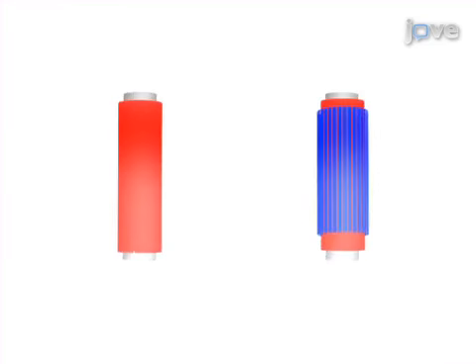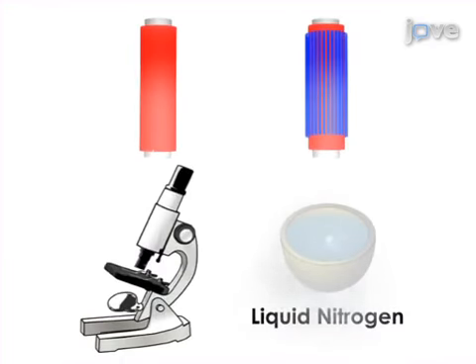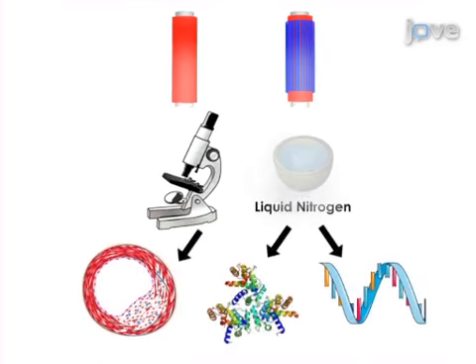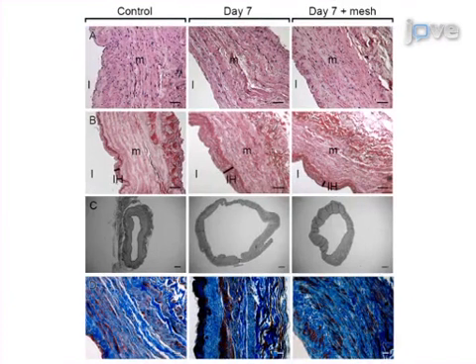The vein segments are then cut into sections for histological and molecular analysis. These analyses are used to evaluate the effect of an external reinforcement on intimal hyperplasia. The results show that an external reinforcement can reduce intimal hyperplasia that is normally observed after 7 days of perfusion.